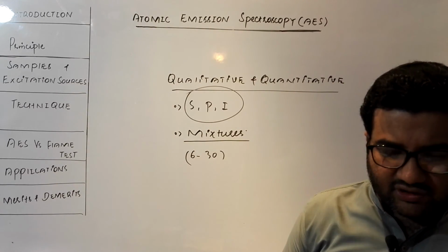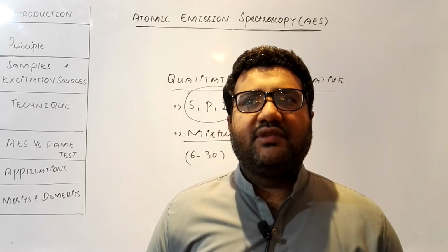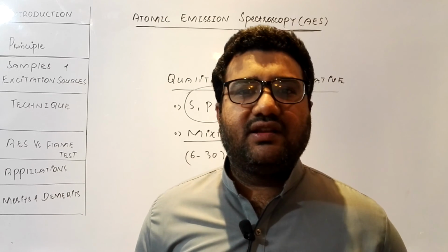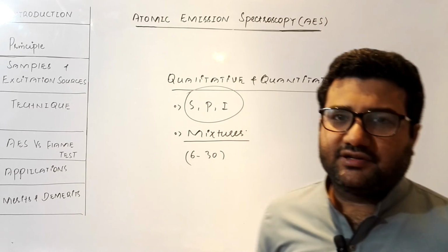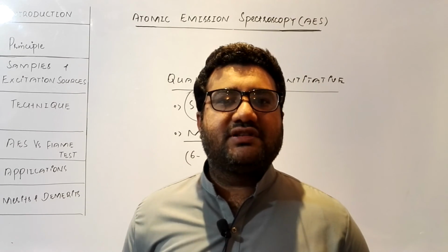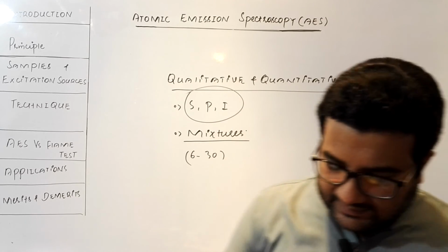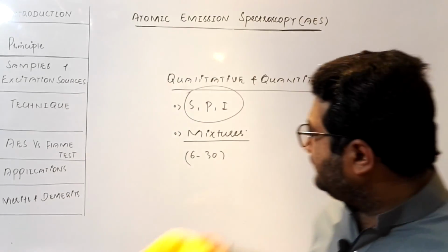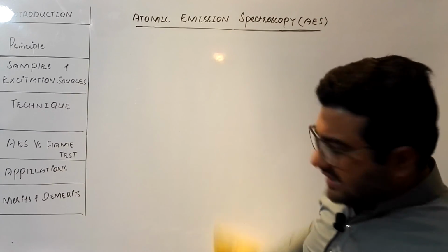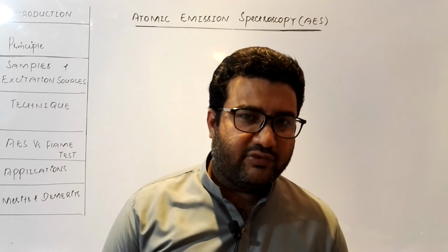Especially when we are talking about alkali metals and we want to study them in pharmaceutical studies, being a student of pharmacy, I also know that atomic emission spectroscopy is quite important for the detection of alkali metals during the processing of pharmaceutical products. So these are some applications of atomic emission spectroscopy. Besides these applications, there are so many others. You will read those applications from your respective books.